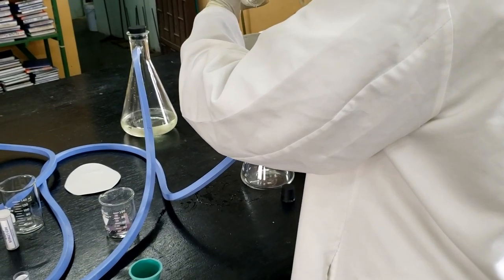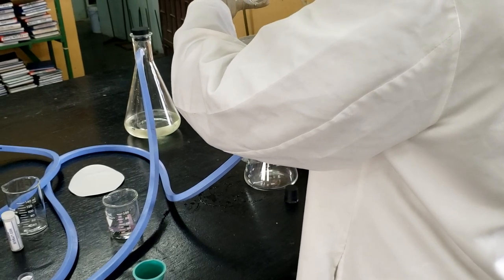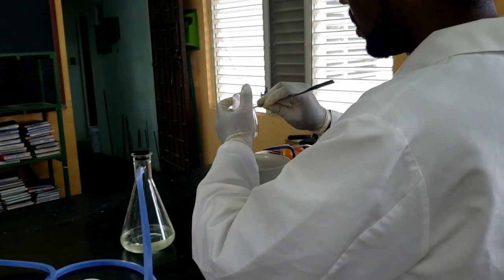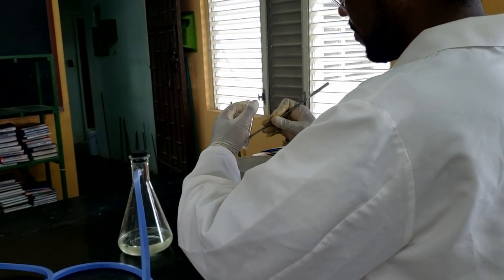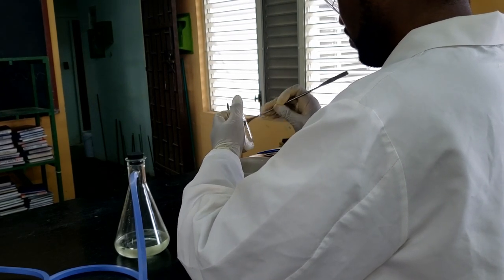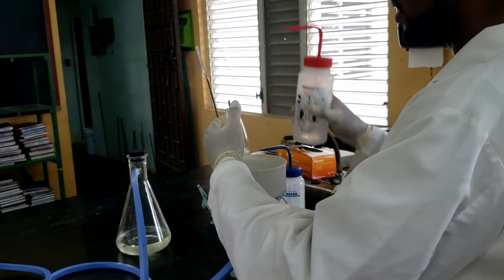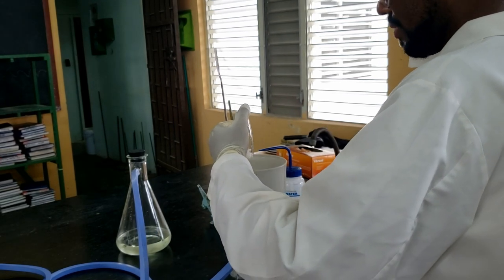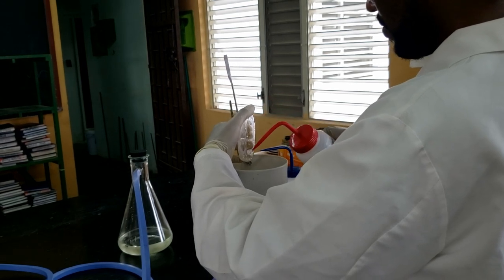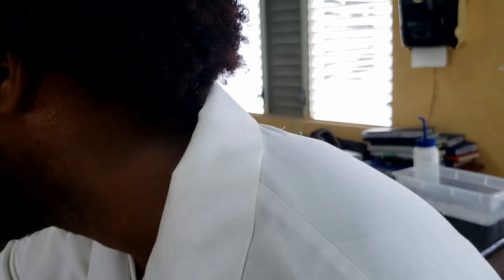As much as possible. A source of error is that we often lose some crystals on the surfaces of the spatula and the stirring rod. And this time we're going to rinse with ice cold ethanol. Turn on the vacuum.